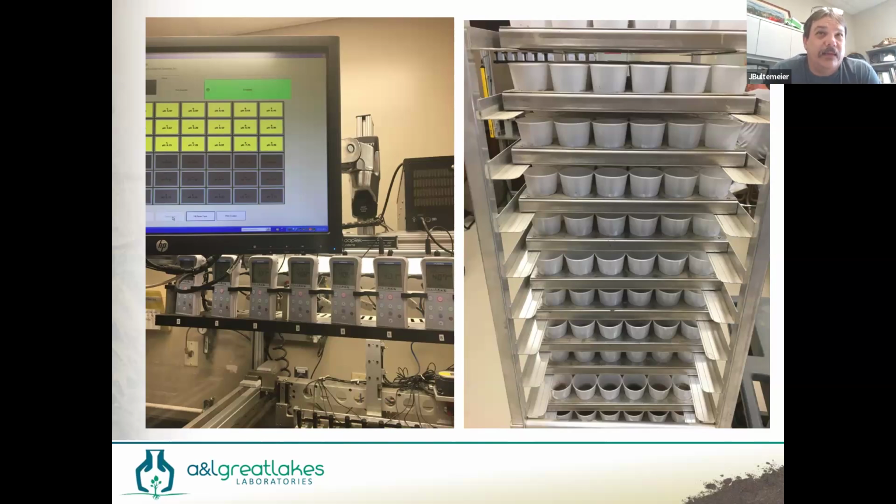Keep in mind where it came from. There is regional specificity to these numbers, and it's usually best to try to stay a little closer to home when it comes to those kinds of levels of interpretation, unless you're really in depth into what those numbers mean and how they could potentially be different.